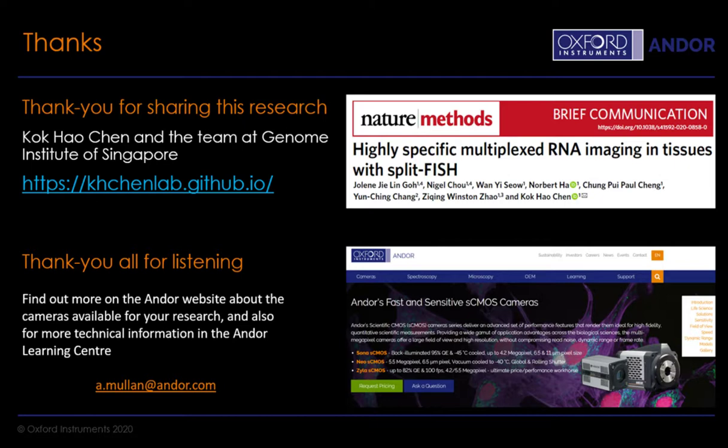So I think the key to applying this on FFPE tissue is firstly, you have to deparaffinize the tissue and maintain the RNA quality, but also probably have to do a screen to verify that the RNA quality of the FFPE tissue is still good before going ahead and profiling its transcriptome. I think it's similar to other FISH approaches on FFPE tissue.